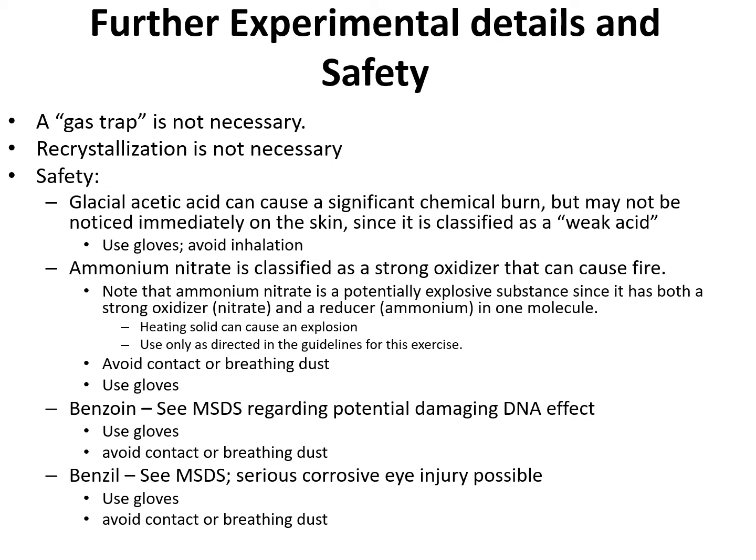And yes, nitrogen gas is evolved in the experiment because it's a sequence reaction from the reduction of the ammonium nitrate to ammonium nitrite, and as a result that ammonium nitrite further goes to nitrogen gas and water.